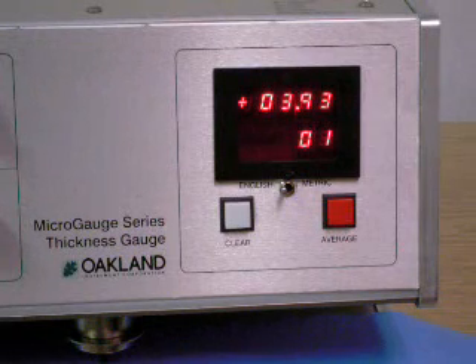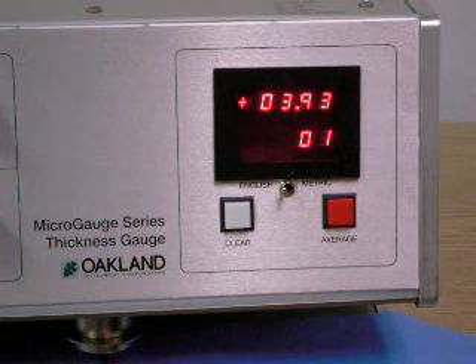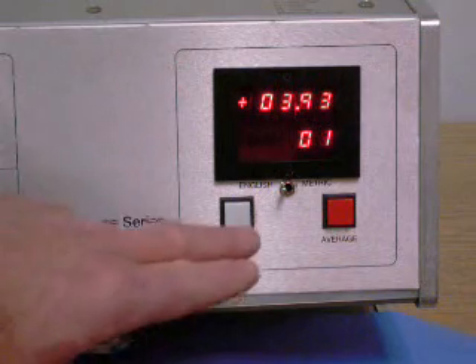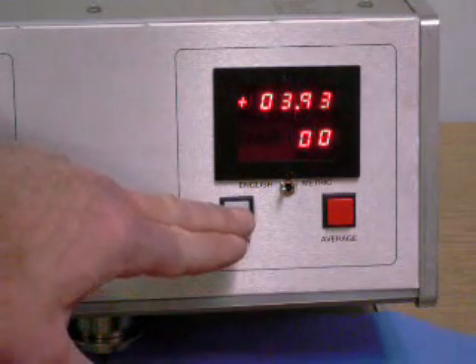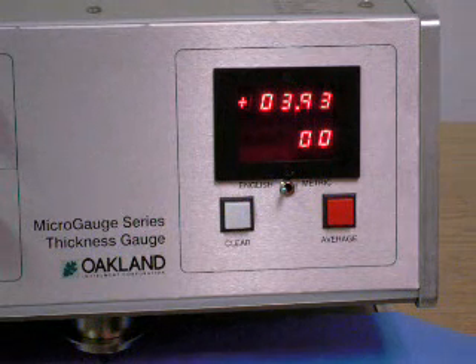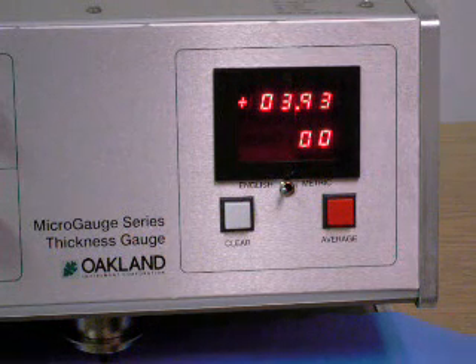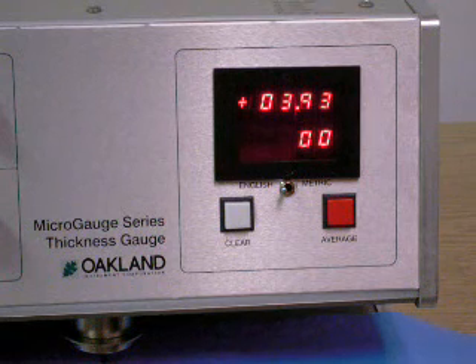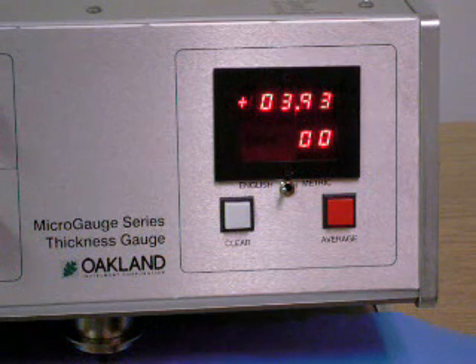Press the white push button labeled clear after recording or printing your data to clear the firmware memory for the next test. Or if you prefer to run more than one sample segment and combine the data into a single data file, simply restart the drive mechanism and the new data will be added to the resident file data.